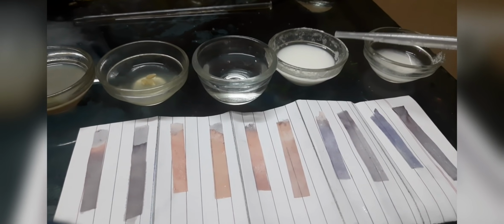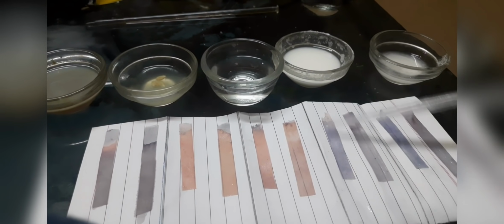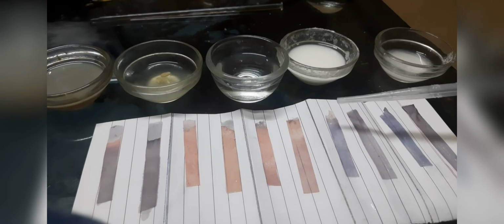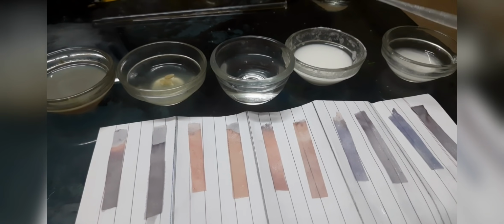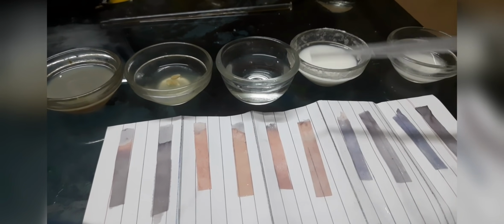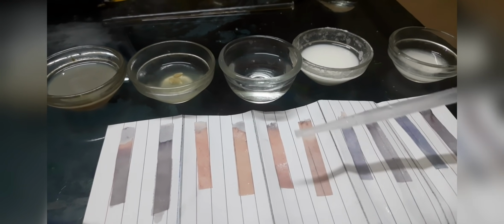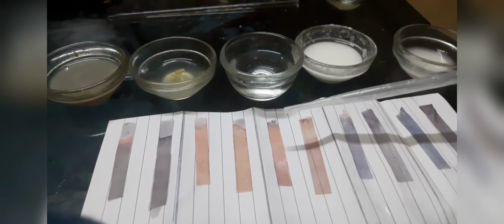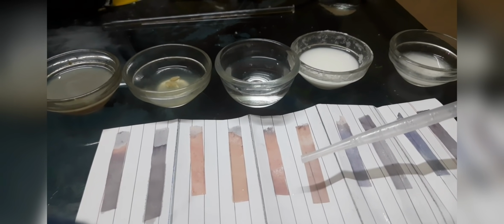Let's move to the other solution, which is the baking powder. In the baking powder, the red litmus again turned blue, but the blue litmus didn't change. So over here also we can say that it is basic in nature. Over here you can see we have tested a diluted solution of vinegar. The red litmus stayed as it is, but the blue litmus changed from blue to red, which means that vinegar is acidic in nature.